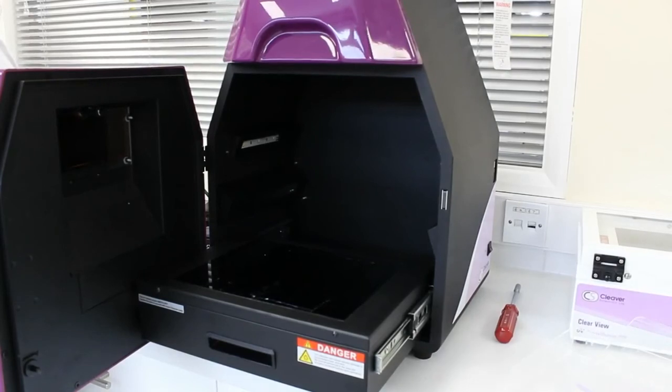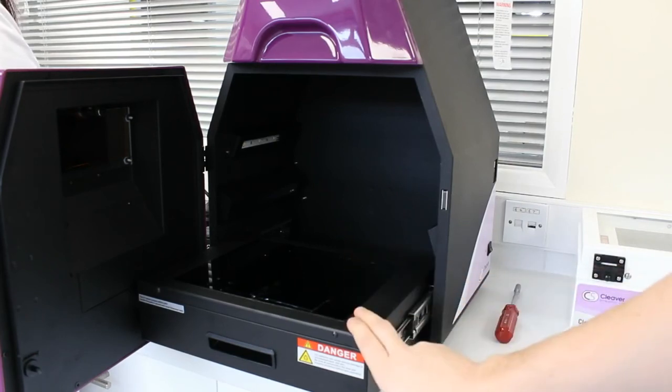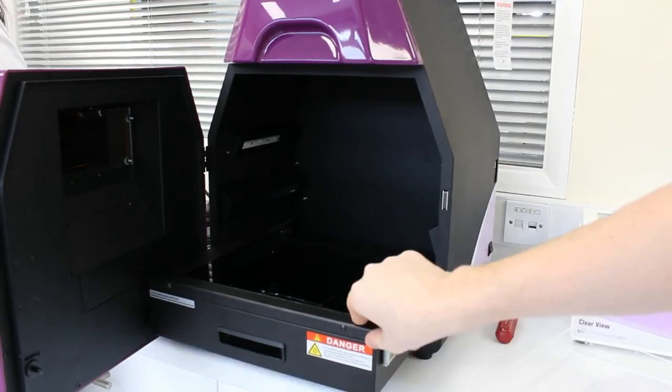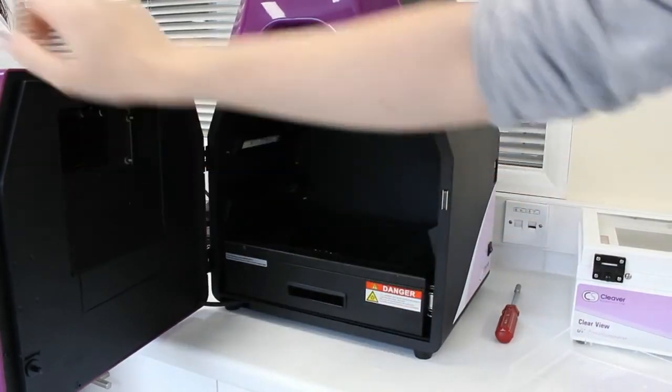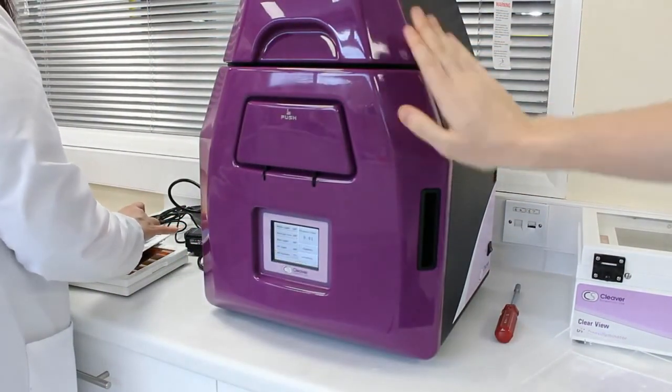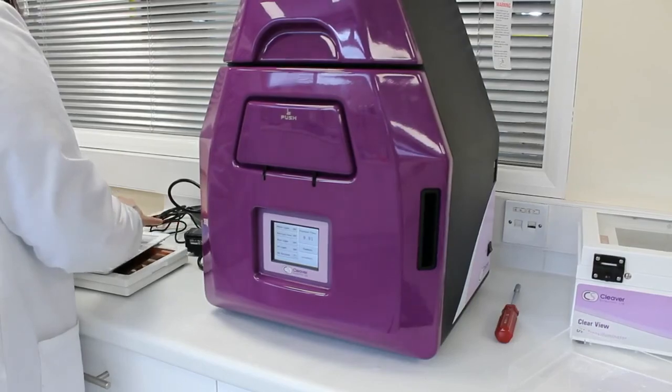Okay, so we've moved our gel from our staining tray using our gel scoop and put it on the transilluminator of our gel dock system. We're going to put this in here, close this up and connect to the gel dock and image the gel.